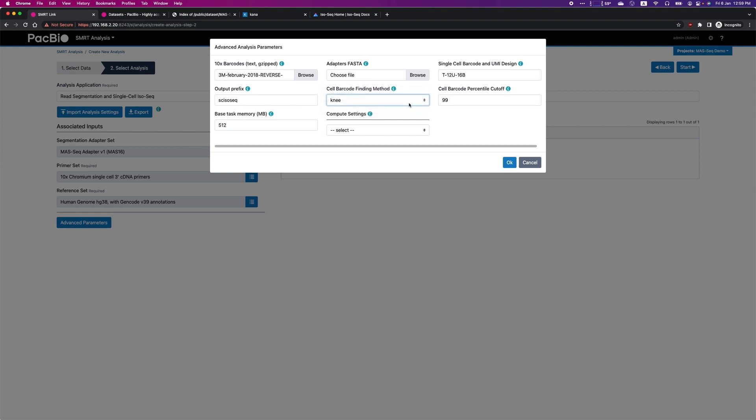As well as modifying the default cell barcode finding method between knee and percentile. The default knee method works well for most datasets, but if you have a dataset that fails to find the correct number of cells, you can use the percentile method.